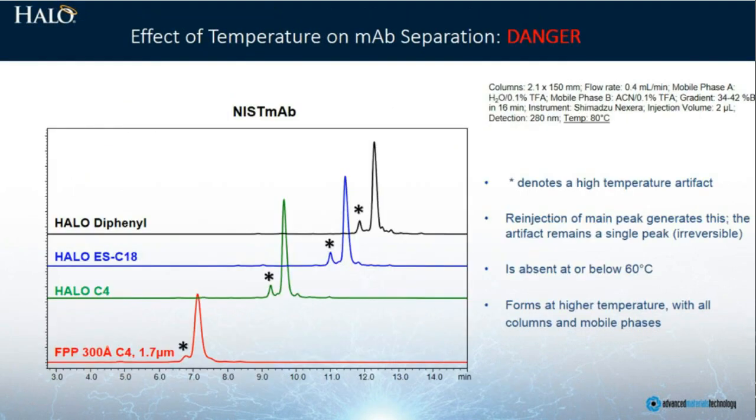Okay, so that's great. You need to operate at elevated temperatures. You can bring the temperature of operation down a little bit if you use an alcohol acetonitrile mixture. That's useful to know. And you can even bring it down further with an aromatic versus an alkyl bonded phase. Why do you really care about temperature? Well, elevated temperature is not without risk.